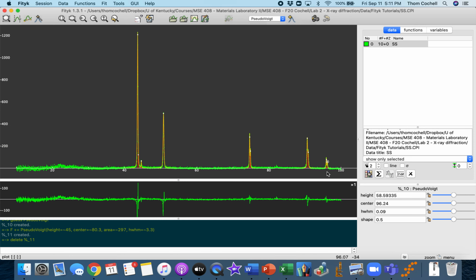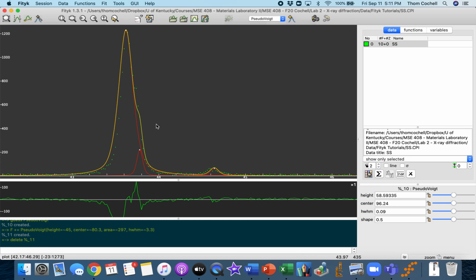So we've got all these peaks located, but I do want to look at one more thing really quick, a different way that we can add it. If we don't like one of the peaks that it added, if you go there, you see the cross came up on it. If you scroll over and you see that cross, you can right click and you can delete it. So if it added something that you didn't like, you can do that. If I go back to the auto add, it should come back, right? So let me delete that one.